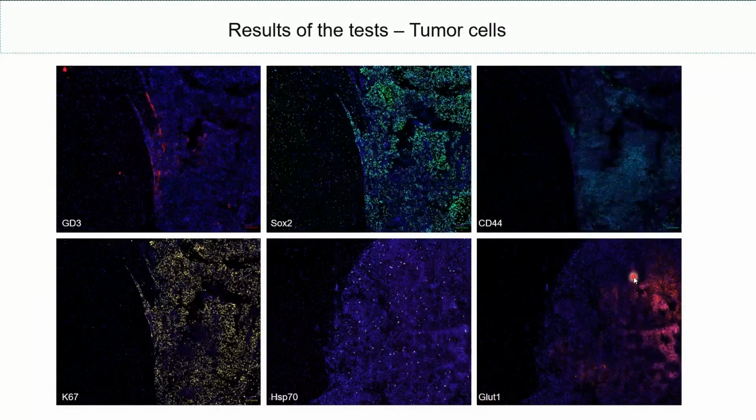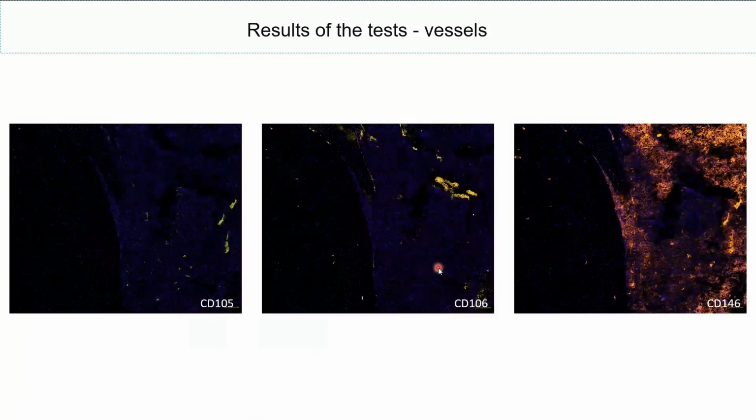And here is the merge, so we can see that some red tumor cells invade the parenchyma, and that most of the tumor cells can proliferate, but we also have some blue clusters which are not immune cells. So this is probably infiltration of cells of the microenvironment.